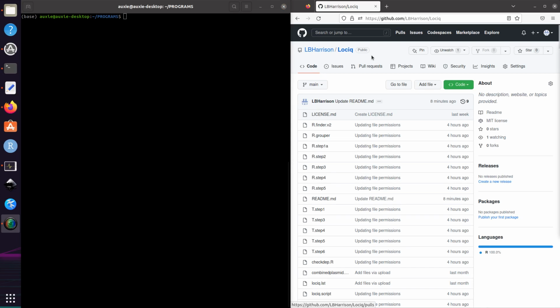This is a quick walkthrough video showing you how to install the Lociq program onto your computer. Now, I'm assuming that you're on a Linux machine, that you have R installed, and that you have either Conda, Anaconda, or Bioconda installed. Those are just package managers.